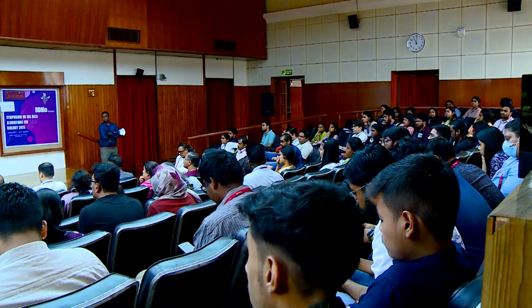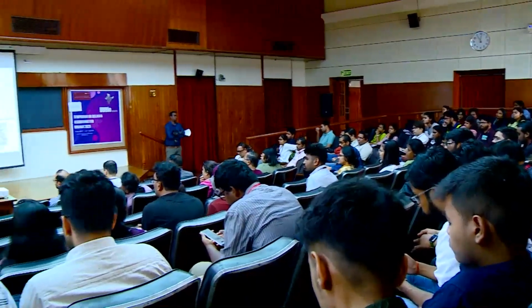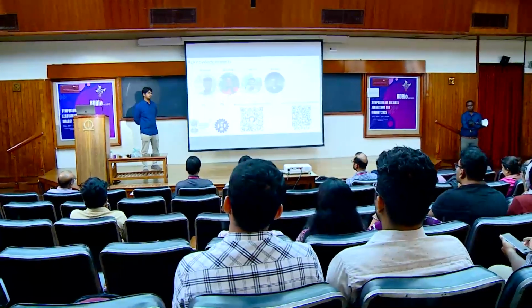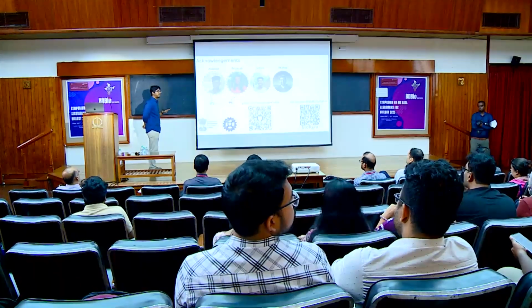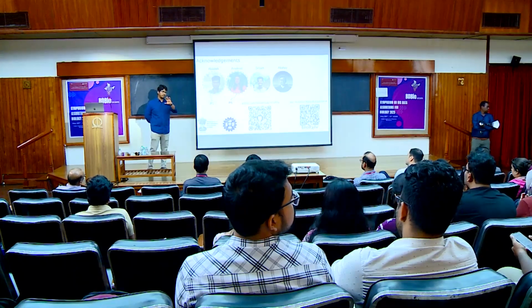Yeah, so there are two ways I can answer this. One is that, yes, you're right that at a clinical level, most of it is still short read, but that is shifting. And the idea is that more and more long read data is coming up, and you need efficient tools to study them. Like there are tools for SNP calling, SV calling, TR, whatever. So that's one part of the answer.